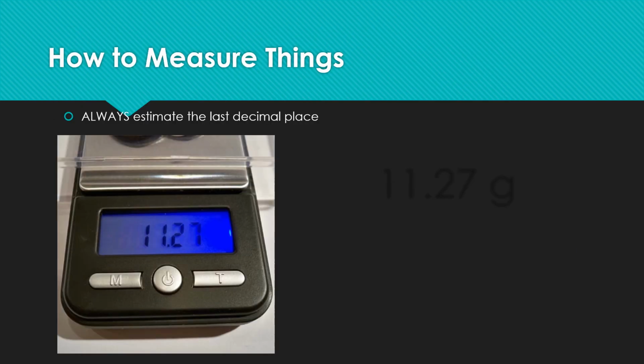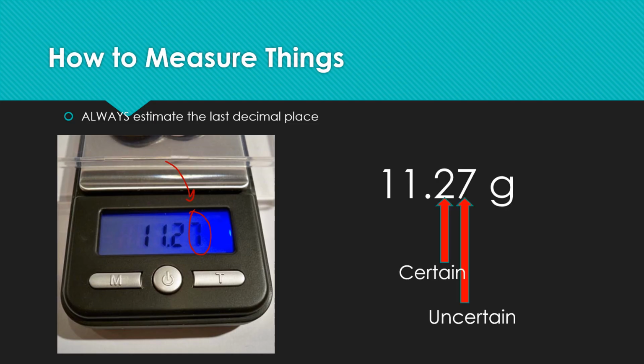So this is an electronic scale. Yes, it gives you all the numbers you need. However, this number right here can always fluctuate, even a gust of wind can actually cause it to change. So that's the one that's going to be the quote-unquote uncertain one. So the first 3 numbers, we're good. We're certain about these. This is the one that we are uncertain about.